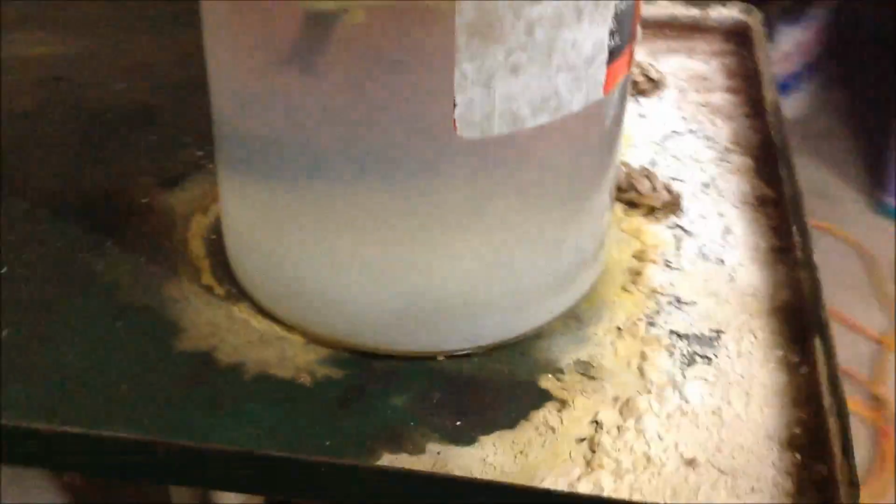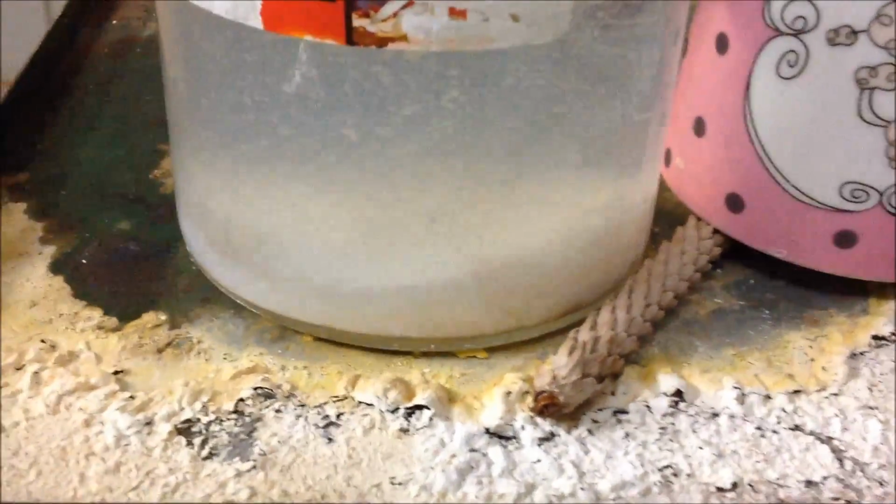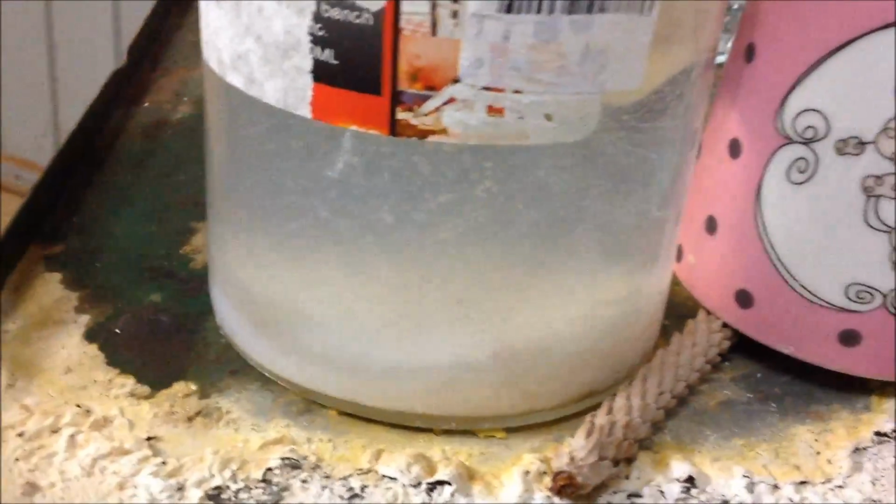I think I'll carefully put that separate and wash that separate. I'll probably include it back in the mix, but I'm just a bit worried that there might be something funny going on there. I don't want to mix it in if I can help it until it's washed. You can see the precipitate building up there on the bottom.